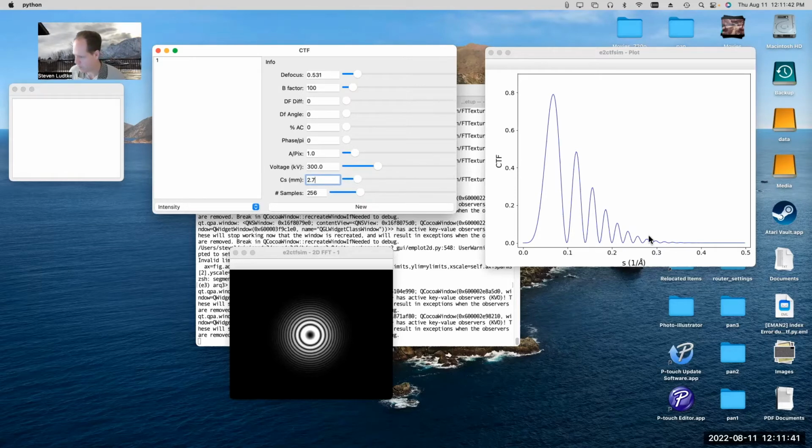If you watch me change it from 2.7 to 4.1, it's a very modest shift in the curve, almost just a little bit of a defocus-like shift. So if you change the Cs, you can almost account for it by just changing the defocus a little bit. Not perfectly, since mathematically it's not exactly representable as a defocus, but for a small perturbation, you can accommodate it fairly effectively.